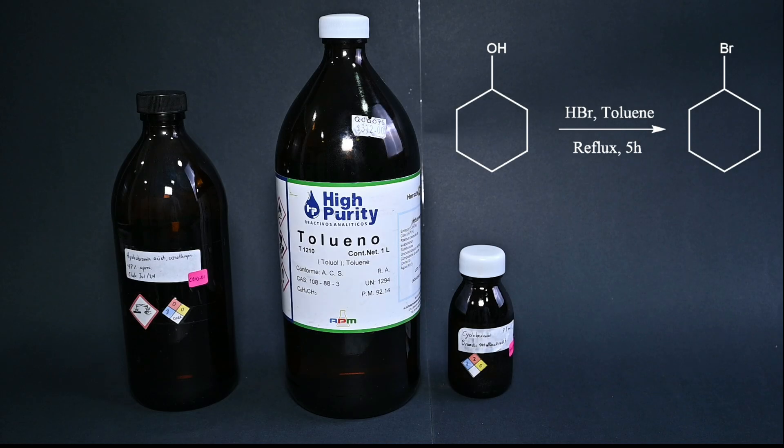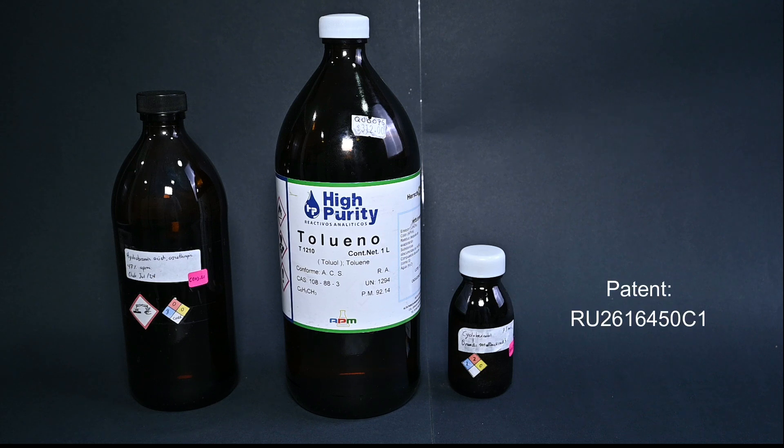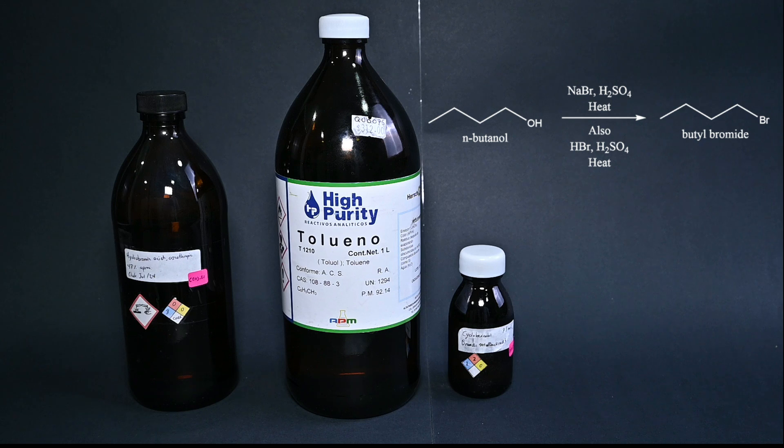Today we're going to perform the synthesis of cyclohexyl bromide using cyclohexanol and hydrobromic acid as the brominating agent. We're also going to use some toluene and a Dean-Stark apparatus. This procedure is taken from a Russian patent and is quite different from other types of bromination — for example, the traditional one found in textbooks using only hydrobromic acid and sulfuric acid.